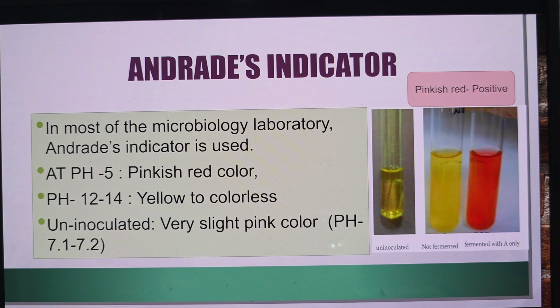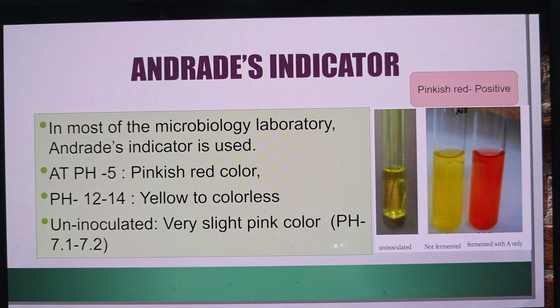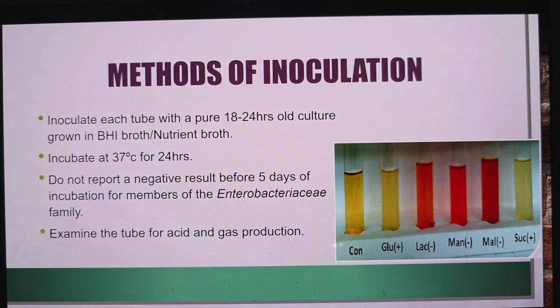Andrade's indicator is used in most of the microbiology laboratories. Acid formation mainly changes the color of the medium to pinkish red color. No acid formation leads to yellow or colorless media. Uninoculated media appears a very slight pink color, pH 7.1 to 7.2.